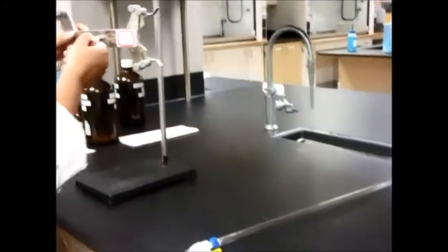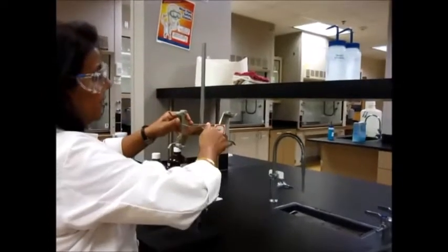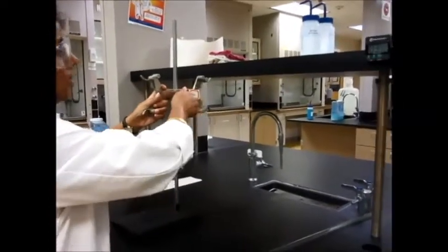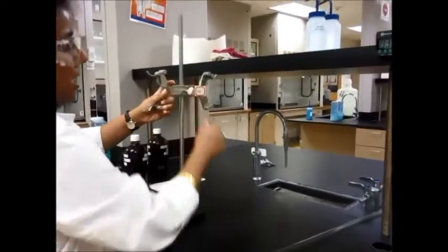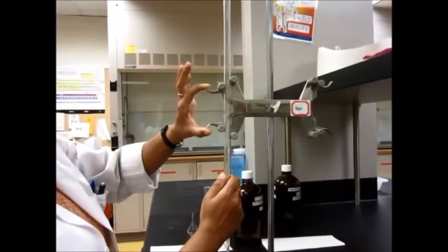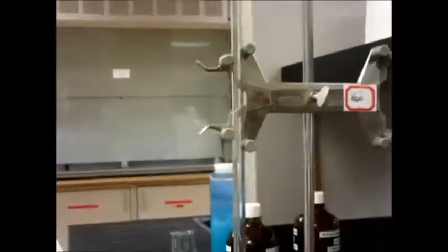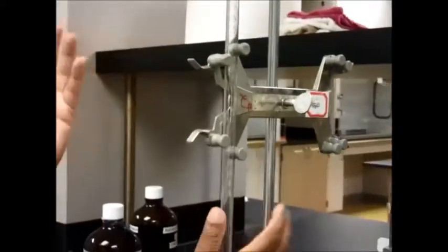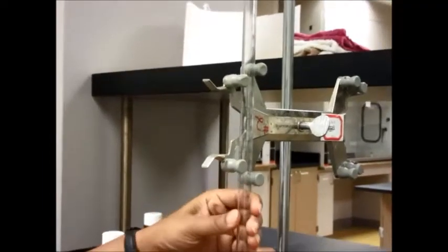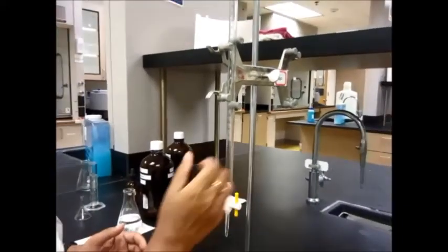To set up a burette, you'll need to set the clamp on here — set it nice and tight so you don't break anything or let it slip down. Then your burette is going to go right here, so pinch the two clamps and put them right here between the grooves. Your burette should be perpendicular to the stand — it should not be tilted in any way, otherwise you will not get a good reading. You can have your burette facing yourself so you can read what you're doing.